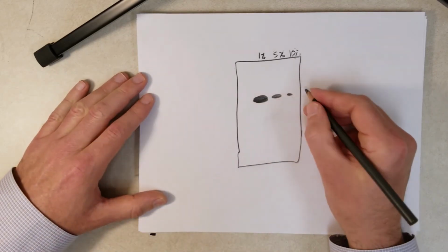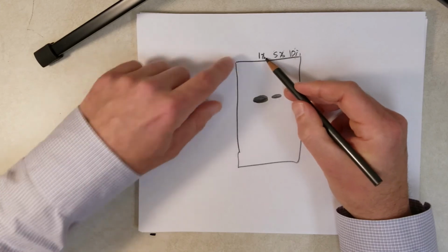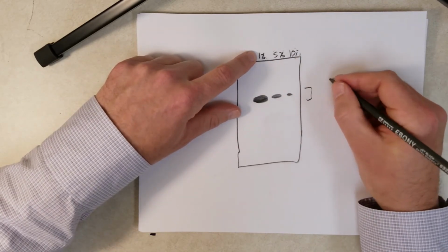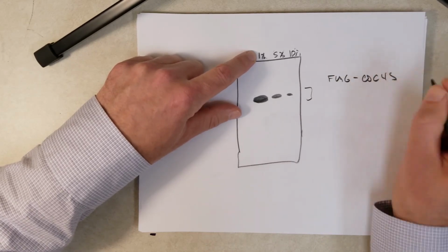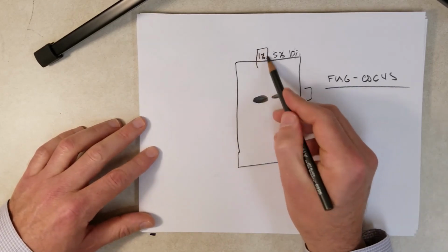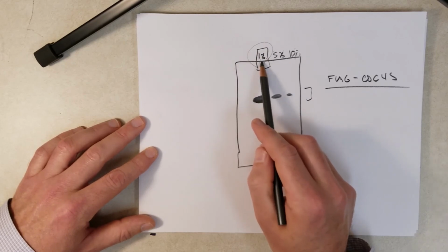and we see the smallest signal for the 10% lane. So if these were the results, which condition would we say gives us the highest level of flag CDC45 protein as a percentage of the total proteins? It would be the 1%. Okay, so this would be this 1% medium, this medium with 1% glucose.